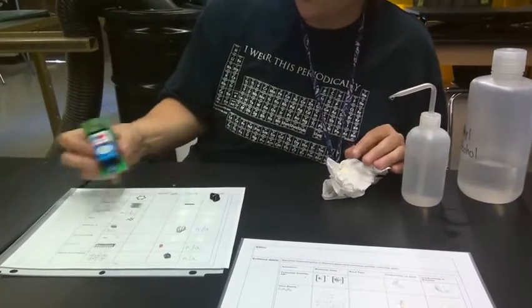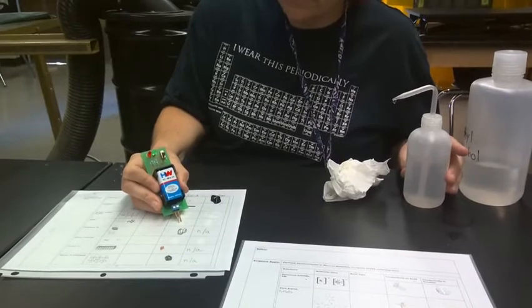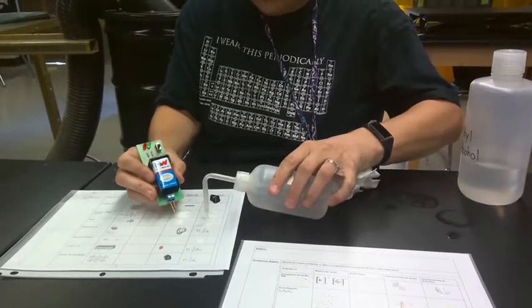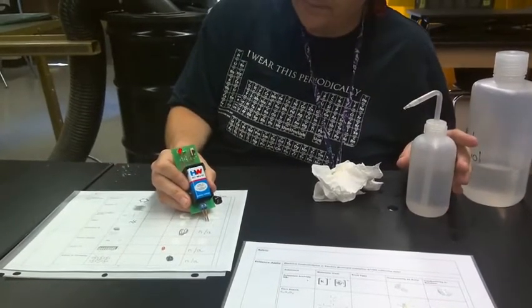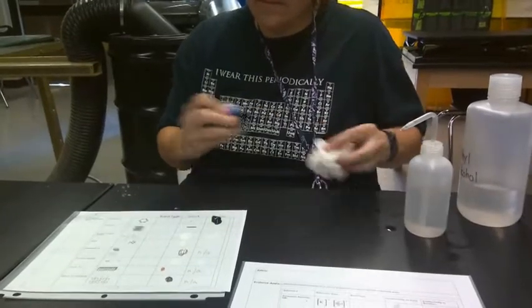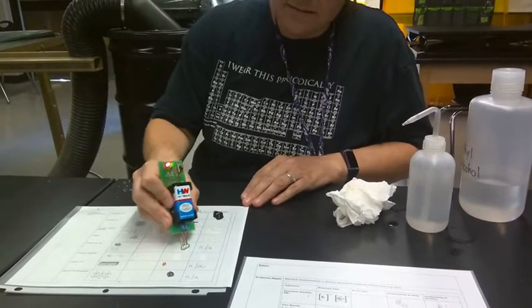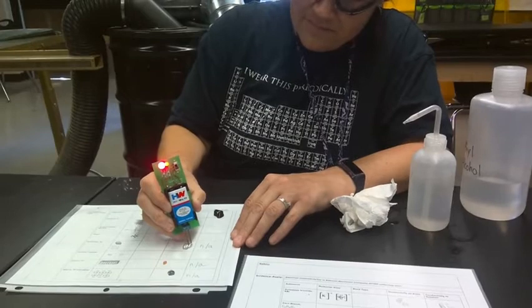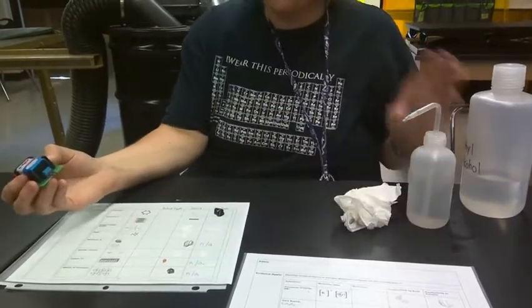Next, I'm on the sugar line as a solid, and in solution. For aluminum, it's a solid. Aluminum doesn't dissolve in water, so we can skip that.